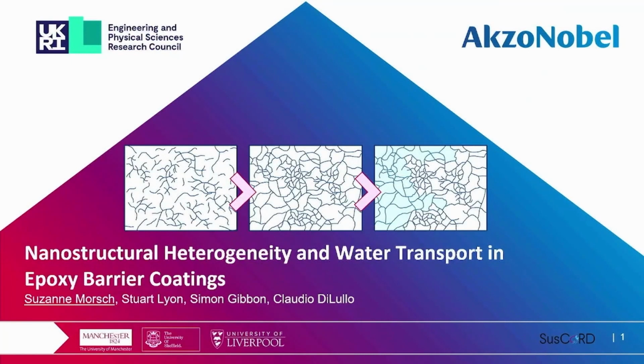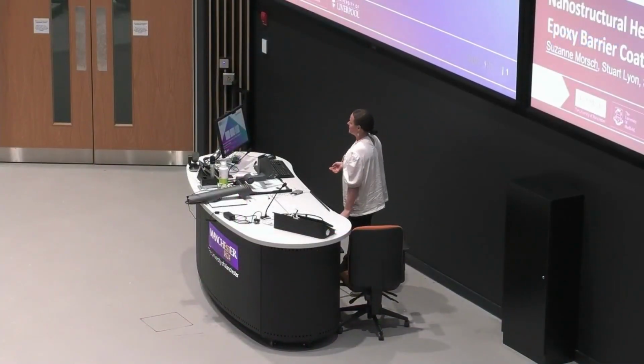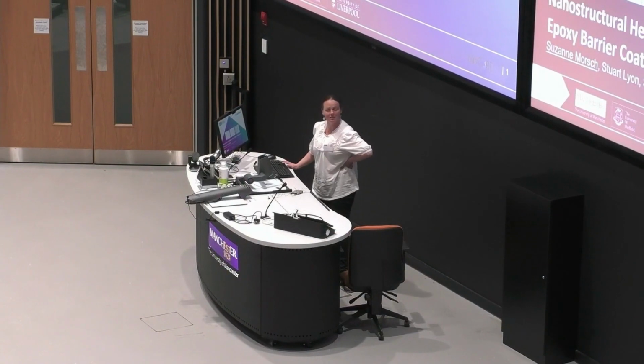It's a little bit different today. I'm going to be talking about some of the work that we did a while ago when I first started in the AFM-IR laboratory in Manchester, really exploring how the fundamental nanostructure in network polymers exists and how it's formed, but also whether we can relate that to water transport through these coatings and ultimately ion transport and corrosion failure.